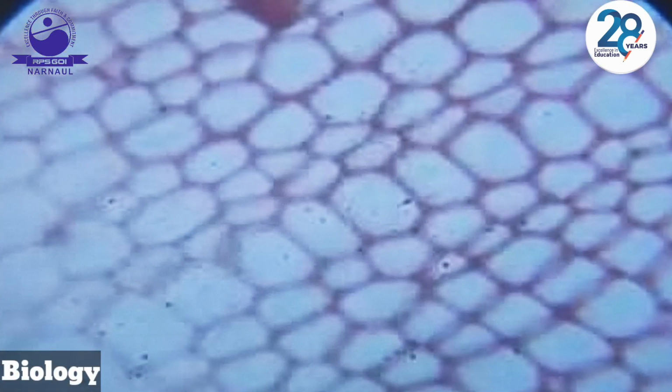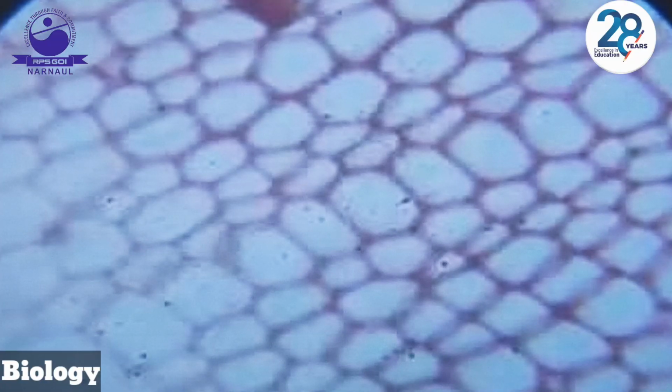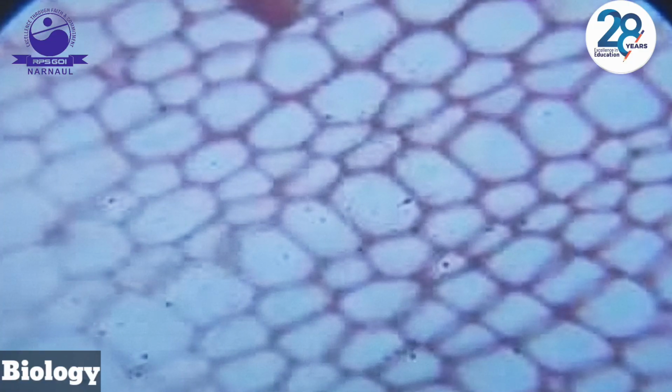Dear students, this belongs to the sclerenchyma. It has thick walls and the new thing is that the cell wall is made up of lignin. They don't have a distinct nucleus. Sclerenchyma cells do not have any cytoplasm or living content. So here we have seen three different types of tissues: parenchyma, collenchyma and sclerenchyma.